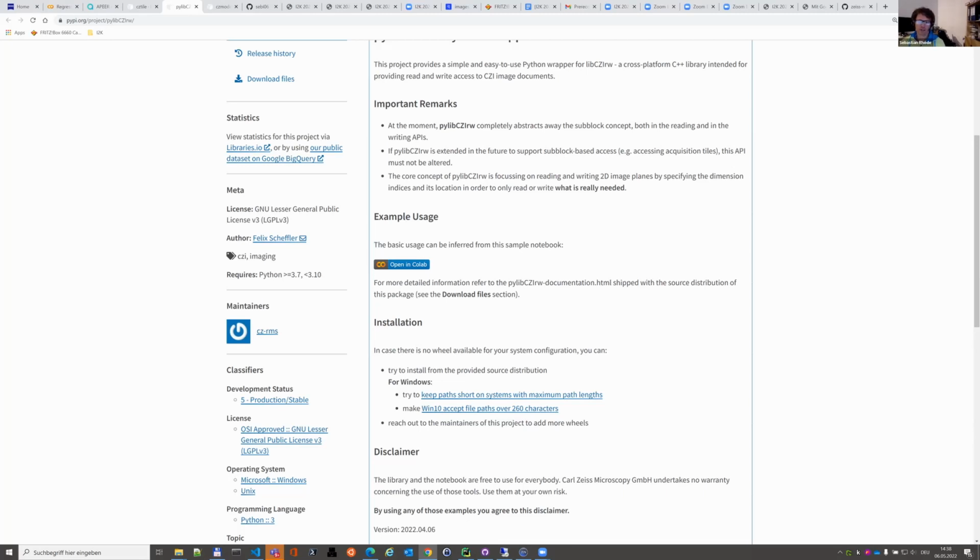And therefore, in its current form, the newly created CZI and the current interface does not allow you to write all kinds of parameters that you can think of. What we already started talking about is allowing you to write your own custom parameters that are specific for your processing applications in this custom attribute field. But please feel free here to give me as much feedback as you want.